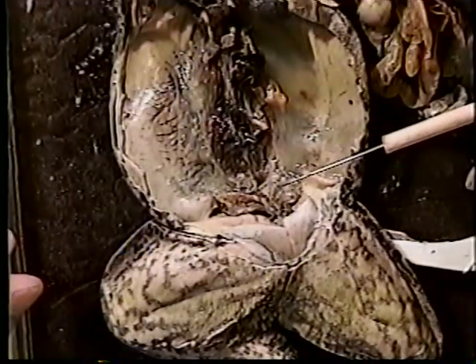To the lower end or posterior end of our frog, we notice two more sac-like organs. These are the urinary bladder.